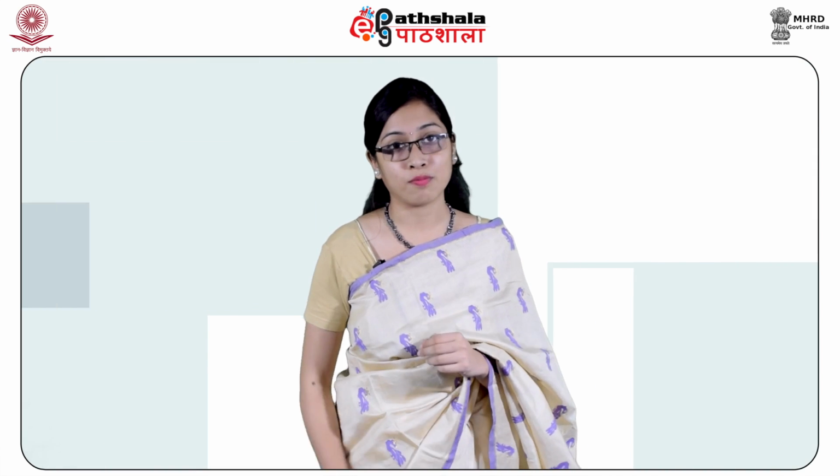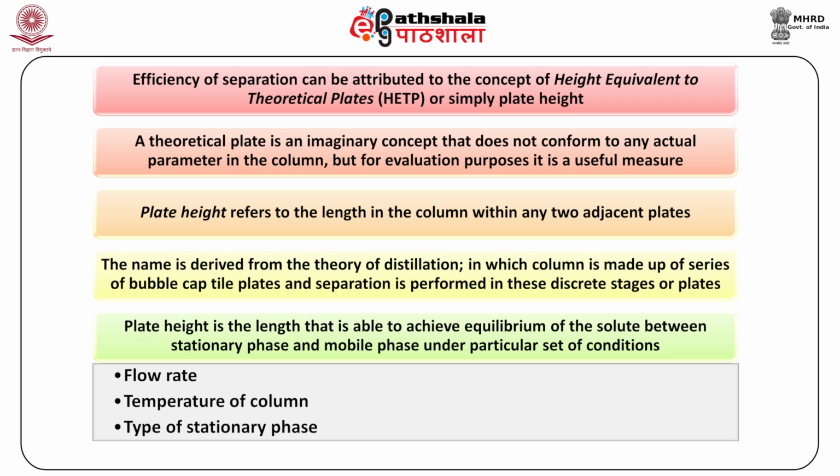The width of a chromatographic peak as recorded on the chromatogram is the culmination of various phenomena taking place in the column. So, we will elaborate on theoretical terms related to the rate of movement of a solute down a column. Efficiency of separation can be attributed to the concept of height equivalent to theoretical plates, or HETP, or simply plate height. A theoretical plate is an imaginary concept that does not conform to any actual parameter in the column, but for evaluation purposes it is a useful measure.